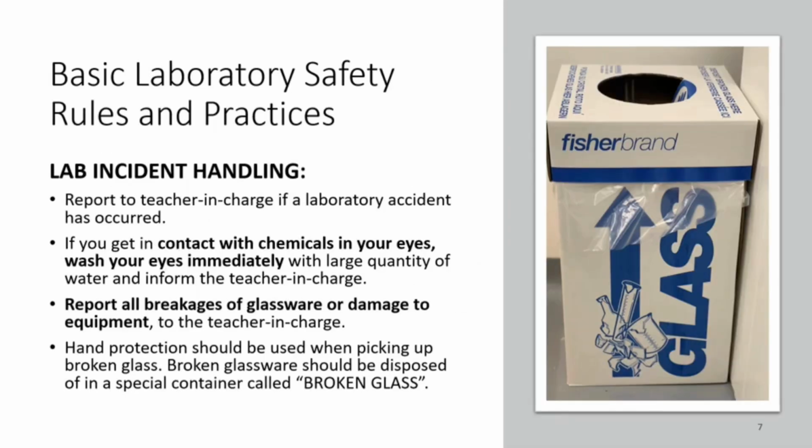Report to the teacher in charge if a lab accident has occurred, however minor, be it a spill, burns, or fire. If you get in contact with chemicals in your eyes, wash your eyes immediately using the eye wash and inform the teacher in charge.